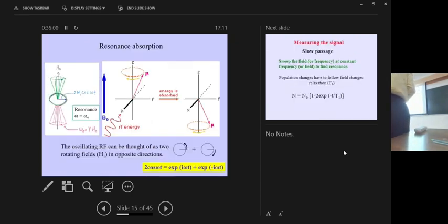Okay, so now here I've shown the same thing. This is the precession of spins in this orientation and spins in this orientation. Now I apply energy, I apply radio frequency, which is along this axis. I apply another field, a small field, H1. This field is H0, the main field, or B0, whatever. And how much is this? This is in kilogauss. So if I take a spectrometer which is like 750 megahertz, this is roughly how much?